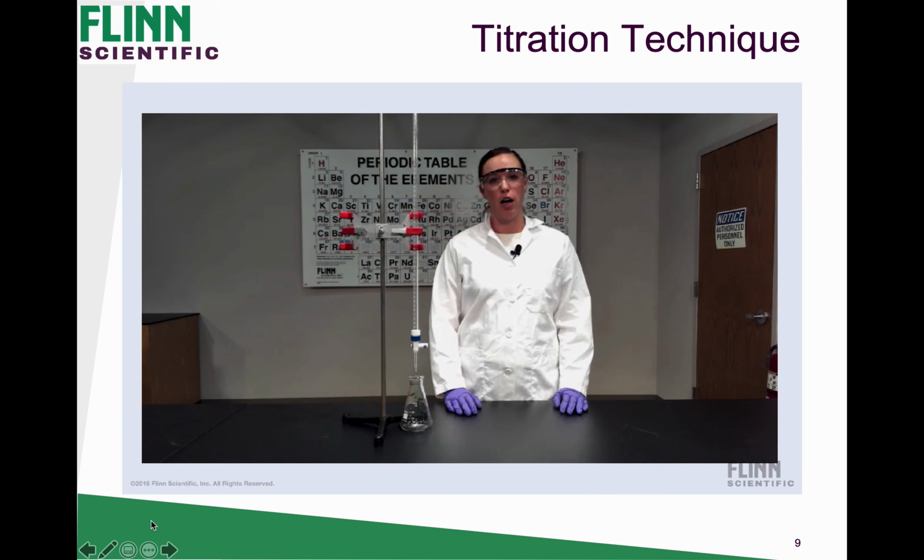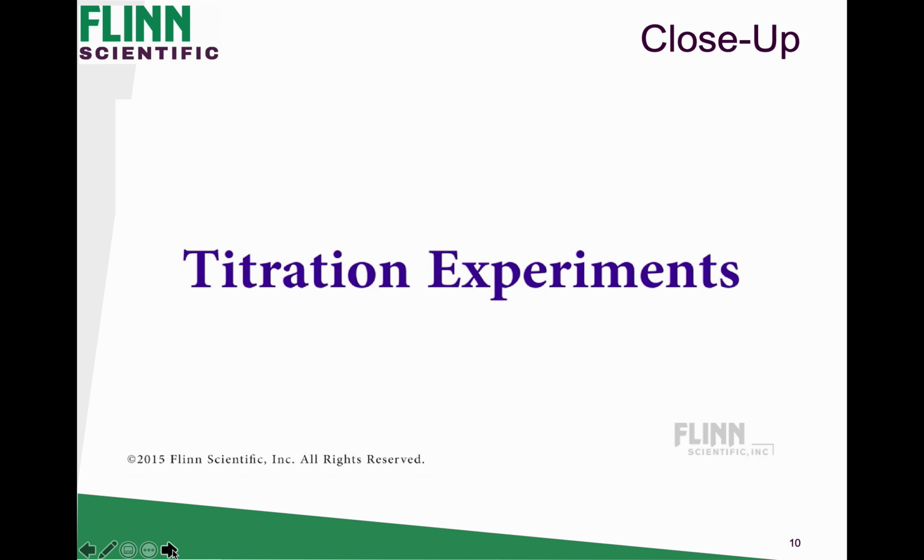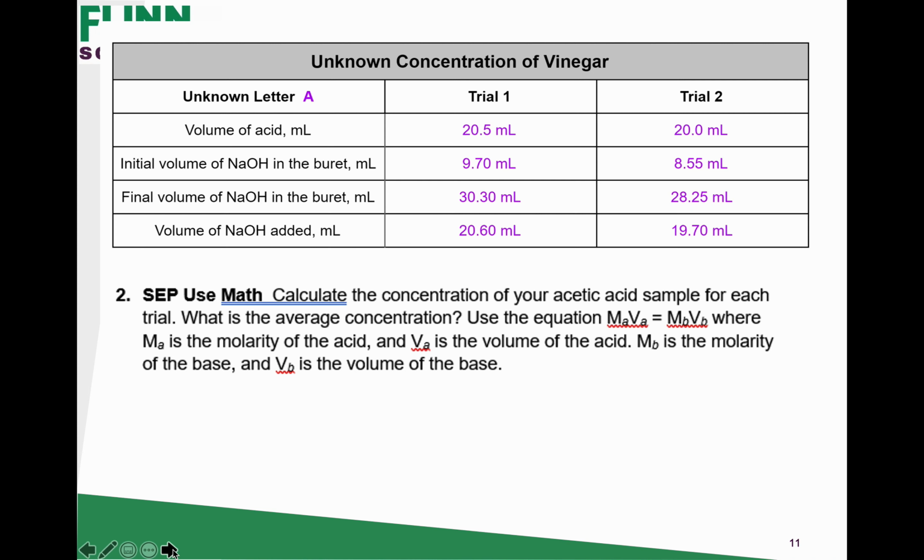In this video, they're going to do a close-up so you can see a little bit closer what is actually happening in that Erlenmeyer flask.